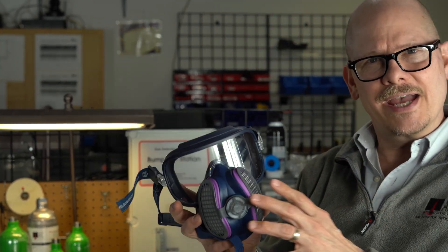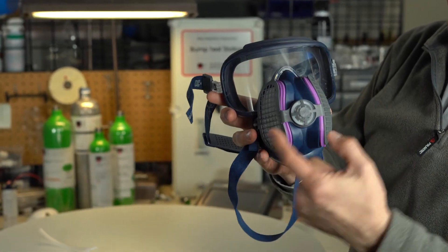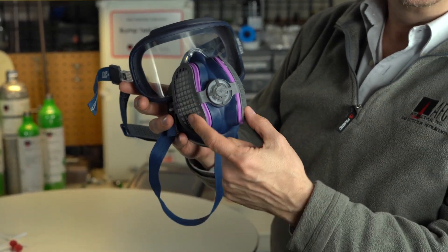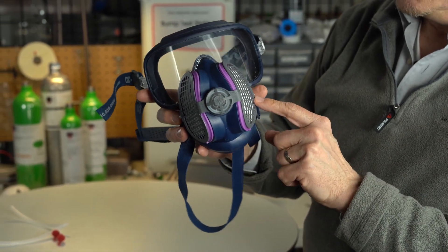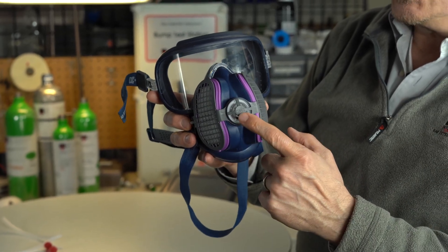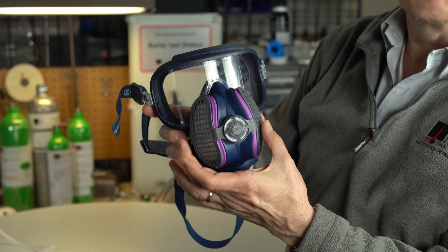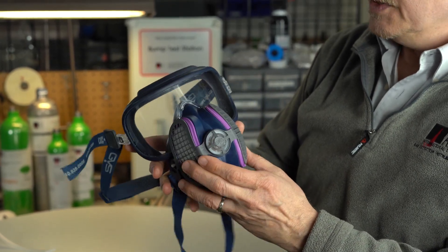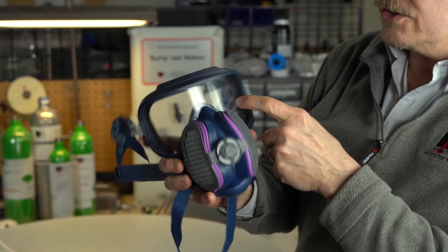You're probably going to just see the mask in my hands. The mask has two P100 high efficiency filters — those are replaceable. I'll show you how to take the filters out in a little bit, but you have an exhalation valve here. You'll be breathing through these two filters on the side. And of course you have eye protection with that Z87 safety glass here as well.